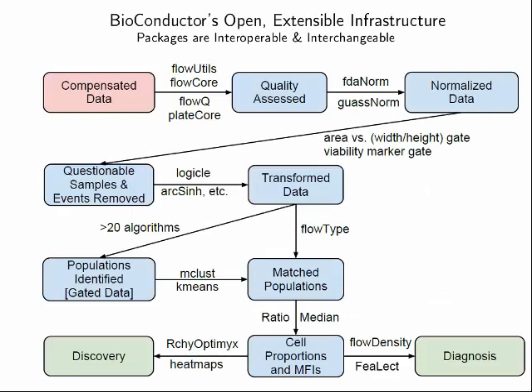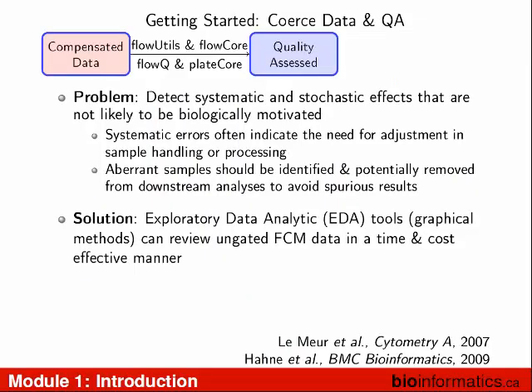So now I'm going to walk you through each of these steps one by one, not on one set of code or one set of data, but more generally, step by step. So it all starts with making sure your data is not crap. The problem is, how do you detect what's crap or not? These errors you have to fix. Or at least you don't have to fix, but you have to be aware that something is happening.